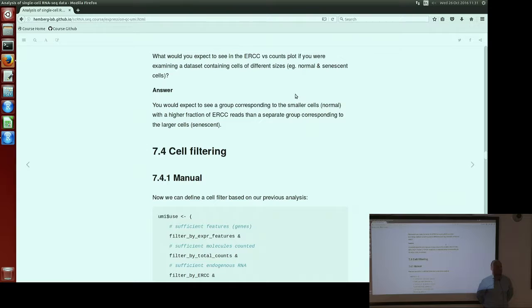But if you're more interested in identifying different cells, then most of the information is actually in whether or not a gene is present or not, and then you can get away with much lower sequencing depth. So obviously, one of the most important trade-offs for your experimental design is number of cells versus sequencing depth. And exactly which point to land at really depends on what is the most important factor for your scientific question.